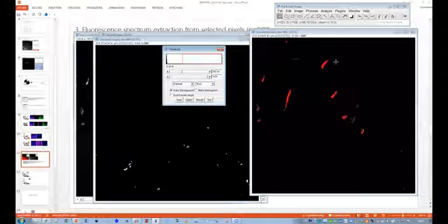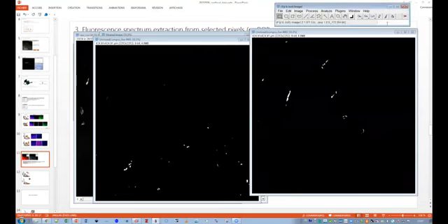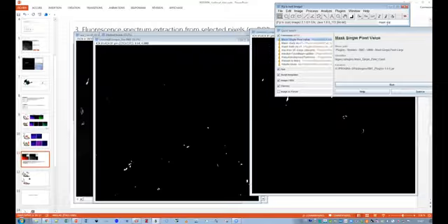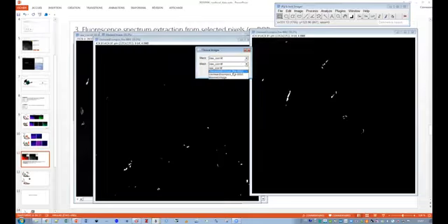You know, it is thresholding the right object, but I apply the same threshold as previously, just to have the same condition. Apply mask. Okay. Run unmix 2.